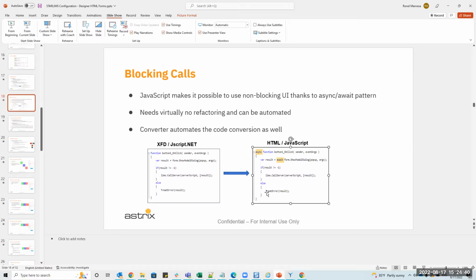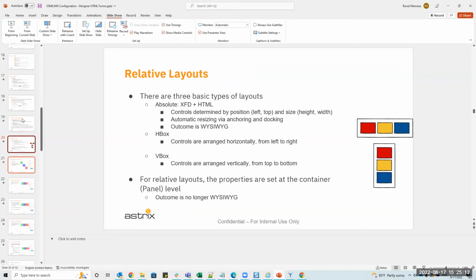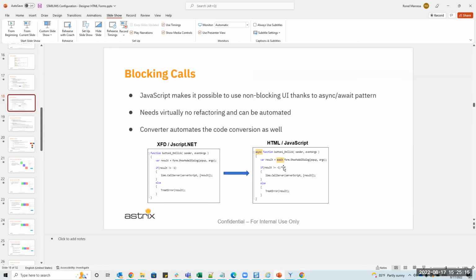and then it continues. If you don't have that, and you try to run this, the program is going to read this line, execute it, move on to the next one, execute it, move on, and your results and stuff are not good anymore because it just continues. So you have to do an await. However, there are certain scenarios where we want this stuff to continue. And then when it comes back, put it into a callback. Does it have that here? Maybe. Okay. So for now, let's keep it like this.